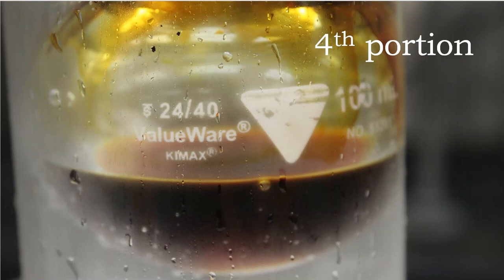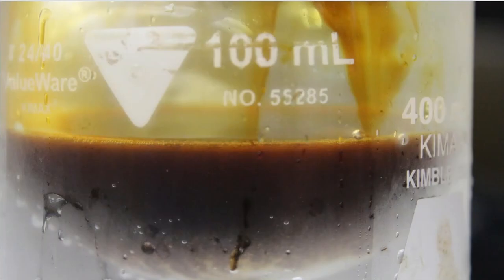After 5 minutes, I then look at this solution one more time, and this is at the end of that 5 minute wait period. I look at the solution, I see that it did not lighten up really too much at all, but that's okay. I'm going to go on to my fifth portion.